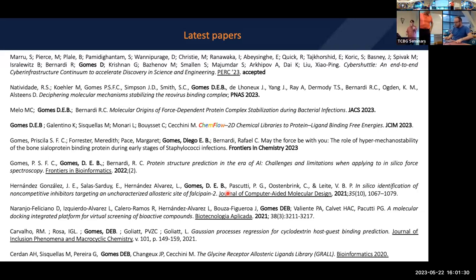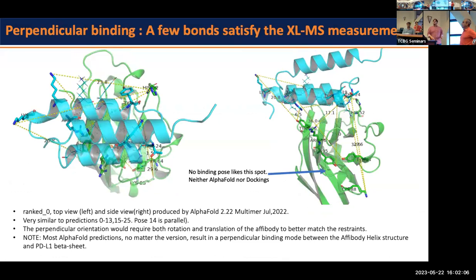Right. Yeah, go ahead. So when you try to predict the complex structure, you said the outcome is probably the orientation is right, but the detailed interface might not be exact. So you have these relative distances in different places that generally match, but it's not really. You're talking about the mass spec. Right. I think this is the figure, right? Yeah, it looks like the molecule is matching that, but the interface is probably not optimal. That is correct.